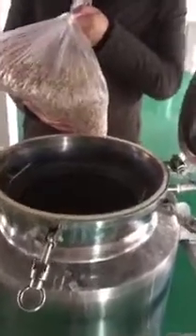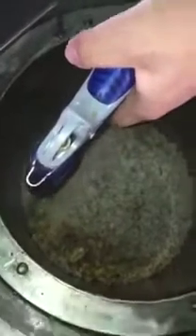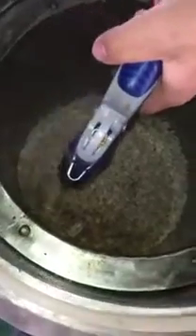Let's pour the frankincense resin into the extraction tank. Then start adding water until it overflows the frankincense resin. Next, close the lid of the extraction tank and tighten all the bolts on the lid.